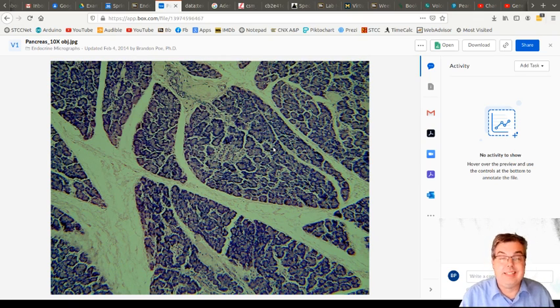The difference is just that the darker staining tissue, which we call exocrine tissue because it's secreting outside of the body, which the digestive tract is effectively outside the body, is making a lot of enzymes to break down all of the nutrient molecules in your food. The islets aren't making that much protein because you don't need that much insulin or glucagon to make the signals that we have.